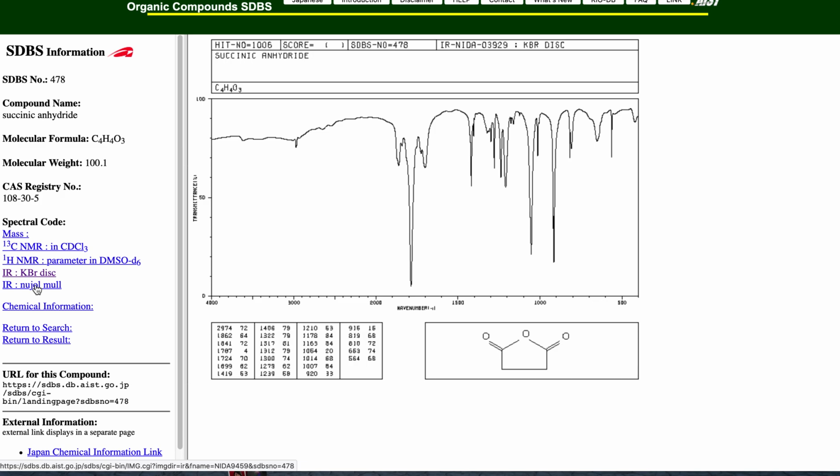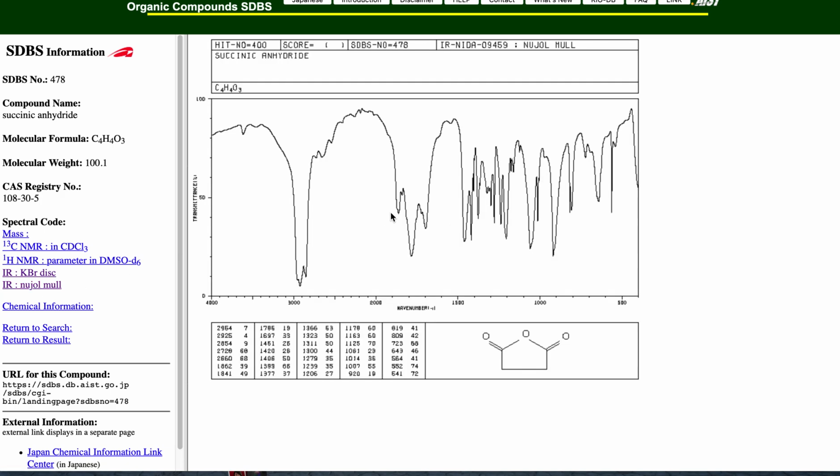So what I'm saying is sometimes you take your compound, if it's a solid, succinic acid anhydride is, and you would put it in a mortar and pestle with Nujol mineral oil. Okay, that's another way to describe it. It's colorless mineral oil. Then you grind it up really well and run the suspension. And this would be the mull. Now notice we have this big prominent band over here. And that's because of the Nujol hydrocarbon. But you could see qualitatively the spectrum does change. Singular spectrum, plural spectra. So you always tell someone how you ran the sample.